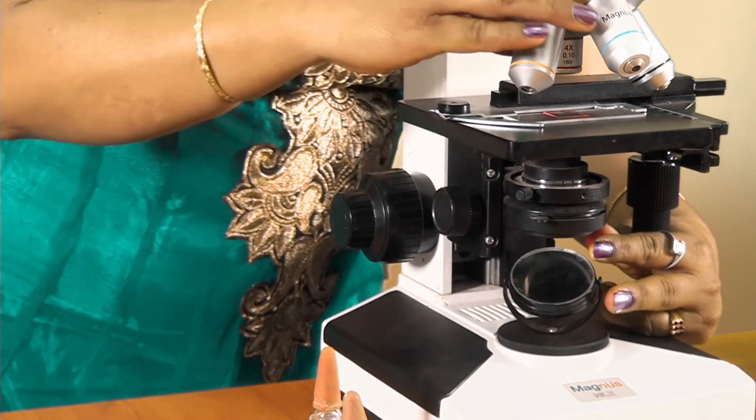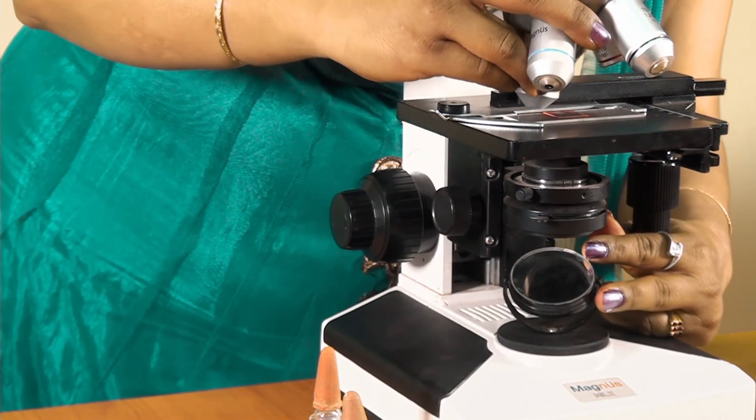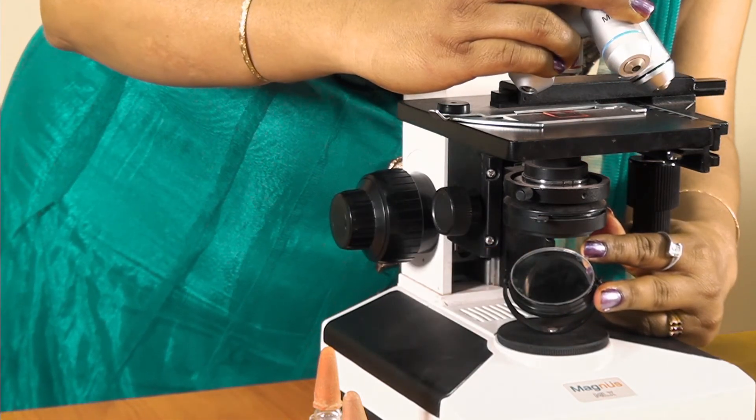This is in the low power. You can observe that the cells are arranged like bricks of a wall. In the high power too, the cell wall, nucleus, and the cytoplasm are clear.